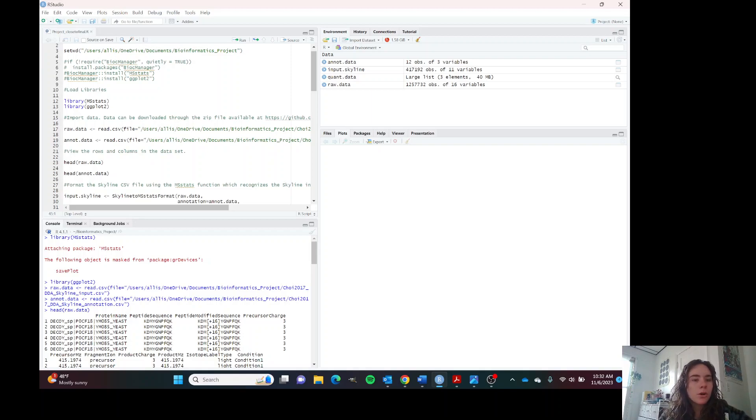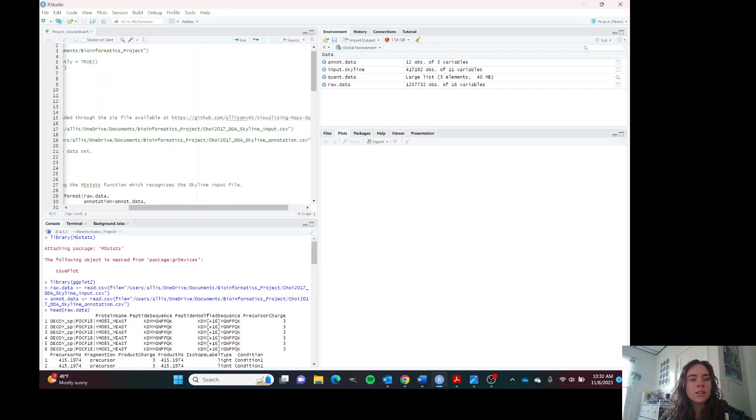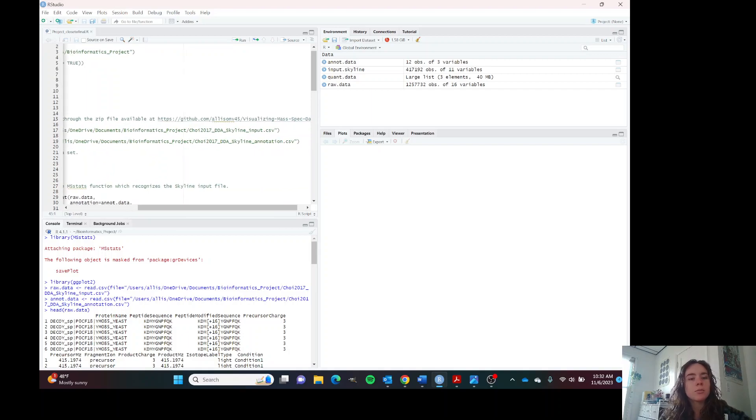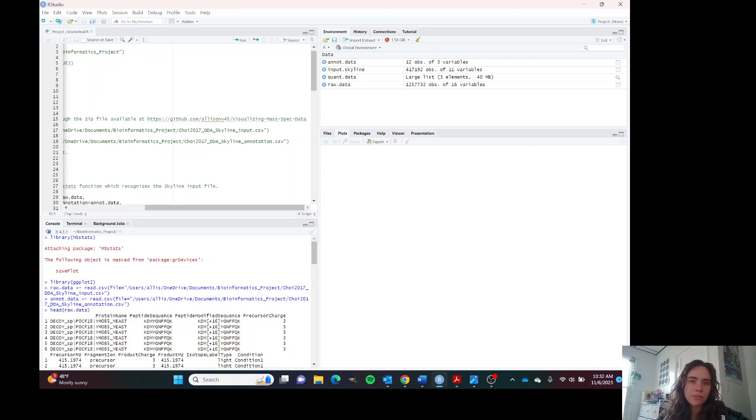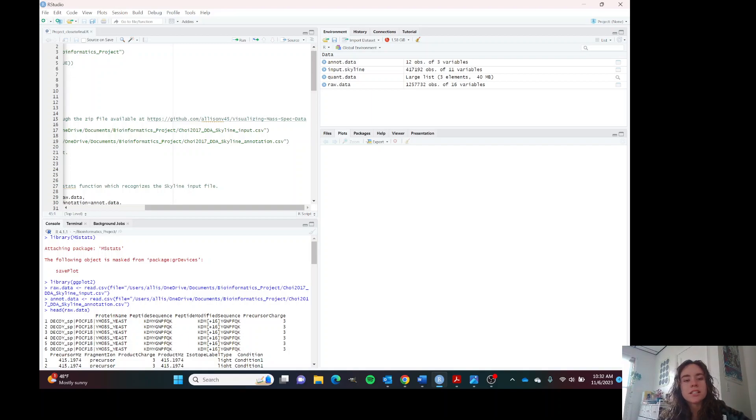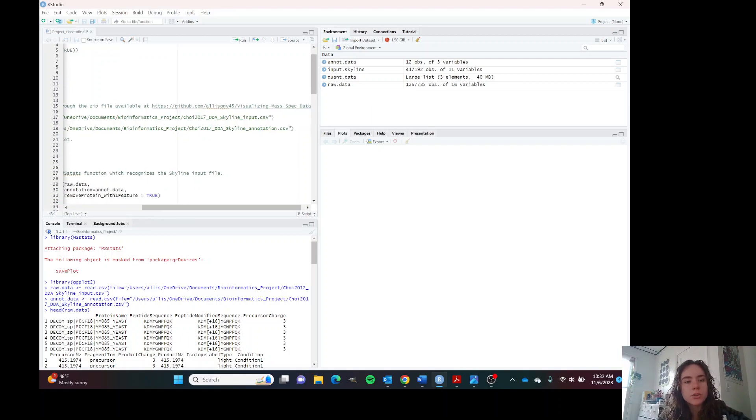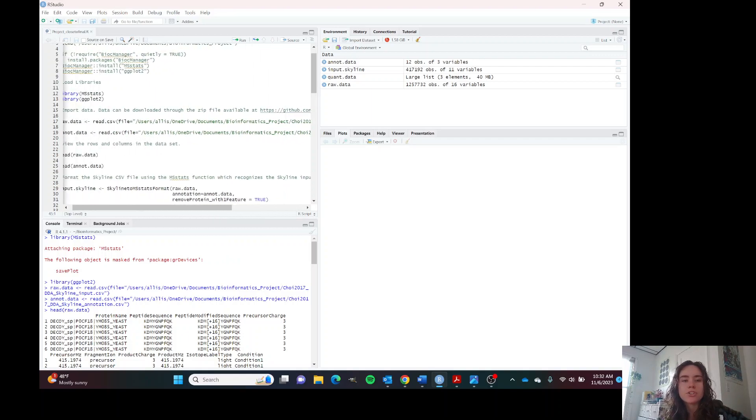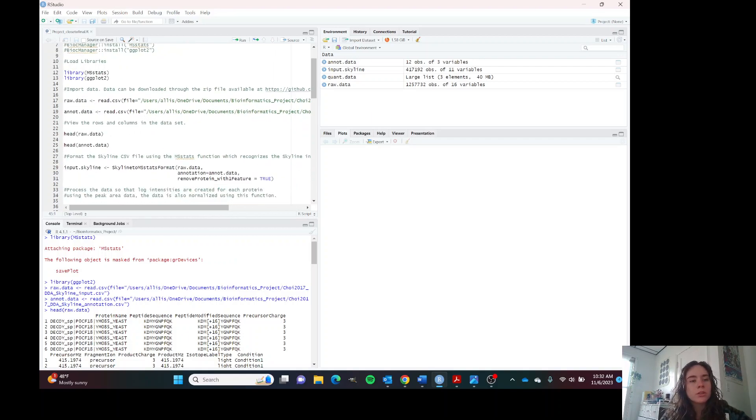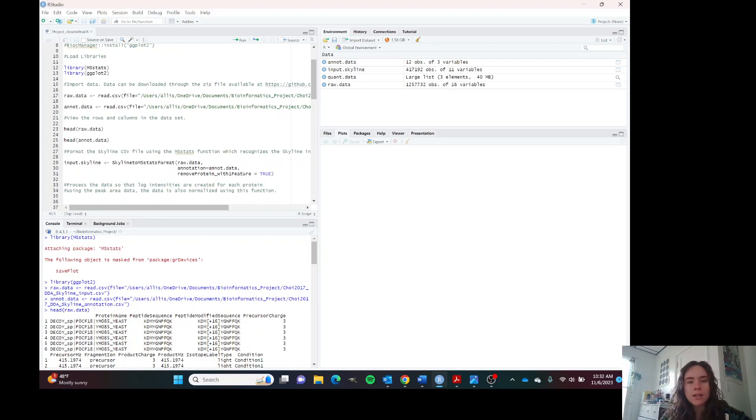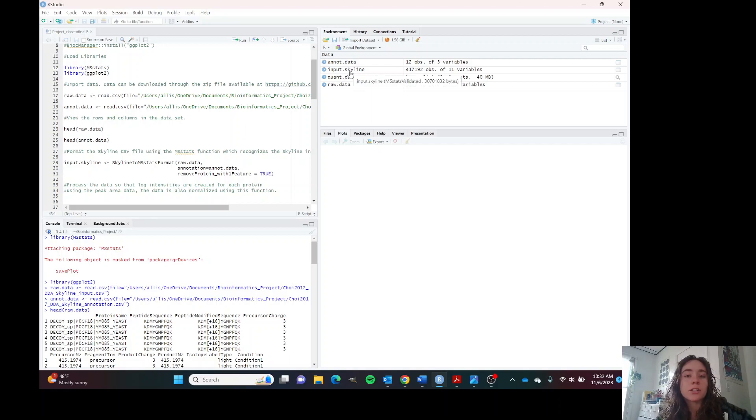The script that I'm going through today is available through this GitHub link. At this GitHub link is also a zip file which you can download and which contains these two data files, the Skyline input file and the annotation file. You can load these two files. I've already done some of this because it does take a while because the input file is very large.